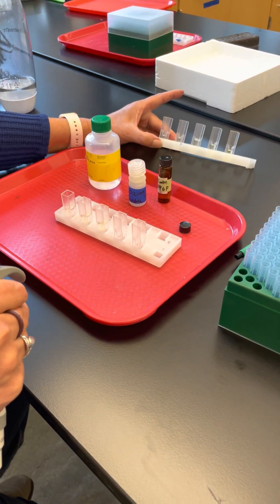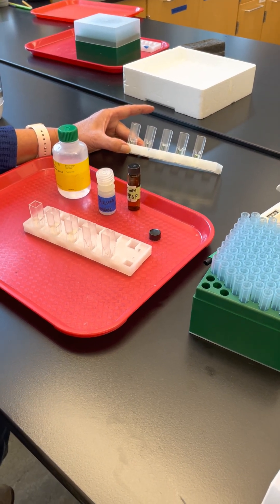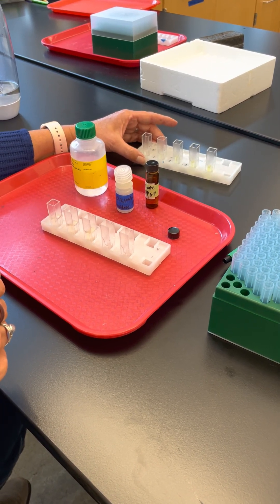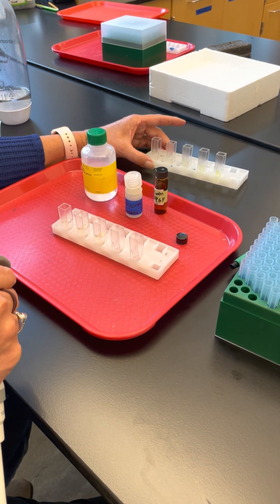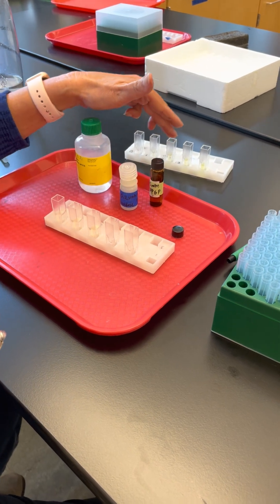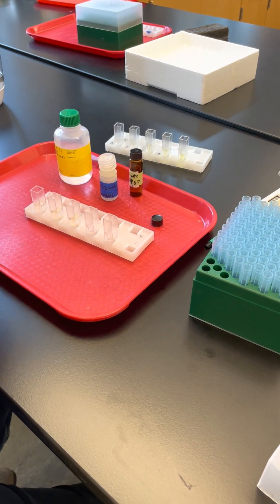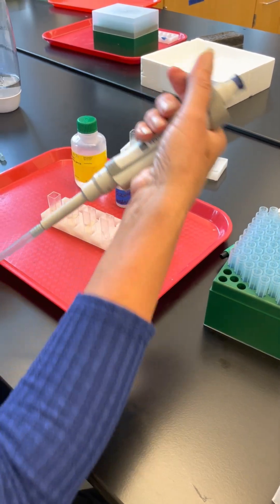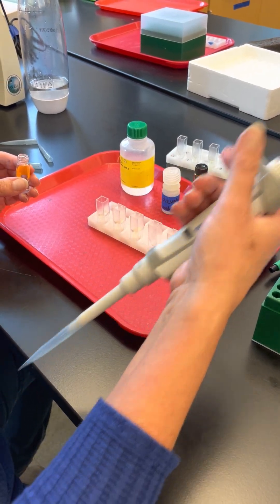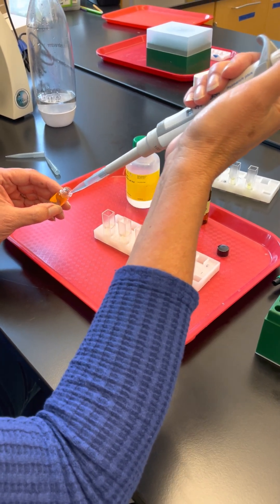Next, you're going to measure what's called the standard curve — similar to what we used in the dialysis membrane lab. These are known amounts of product. We'll use the spectrophotometer to read the optical density of these known amounts and then compare that to our samples to determine how much product we actually have.